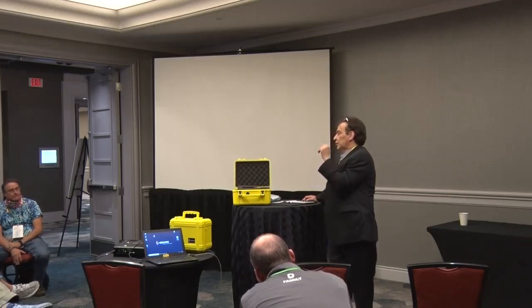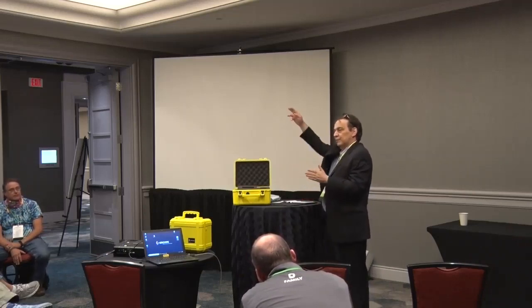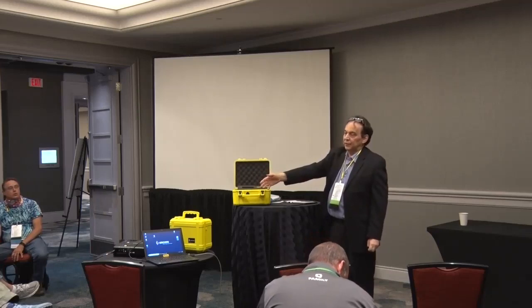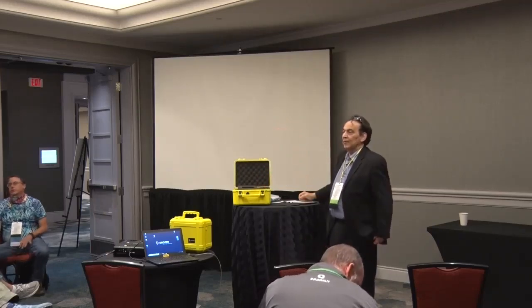In the first 15 seconds, you get about half of where it's finally gonna plateau. When I did it here, at 15 seconds it was about 600, and when it finally plateaued it went to 1,000, 1,200. I probably wouldn't do a 15 second snip.